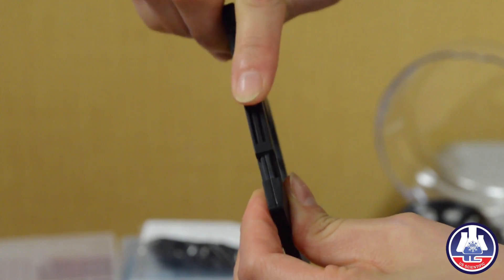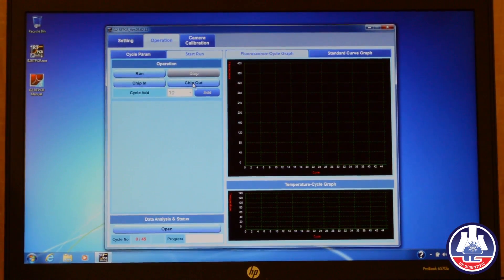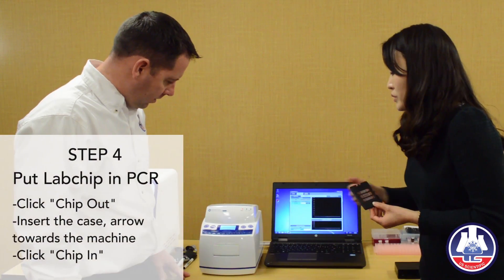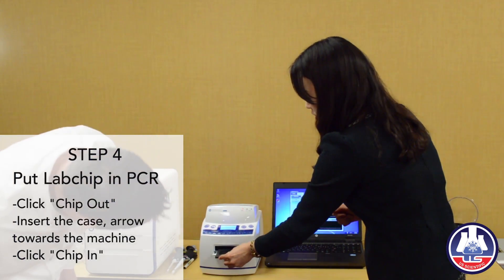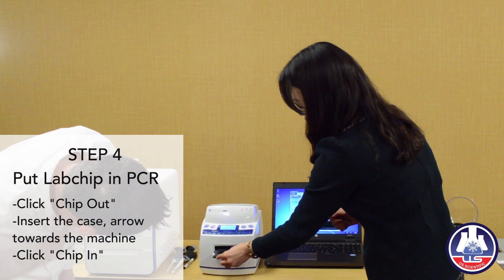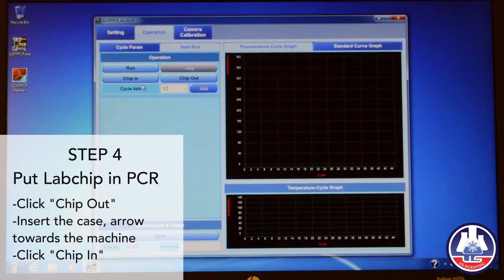Go to the software, in the operation tab. When you click the chip-out button, the door will be opened automatically. Then insert your chip case here like this, and then click the chip-in button to close.